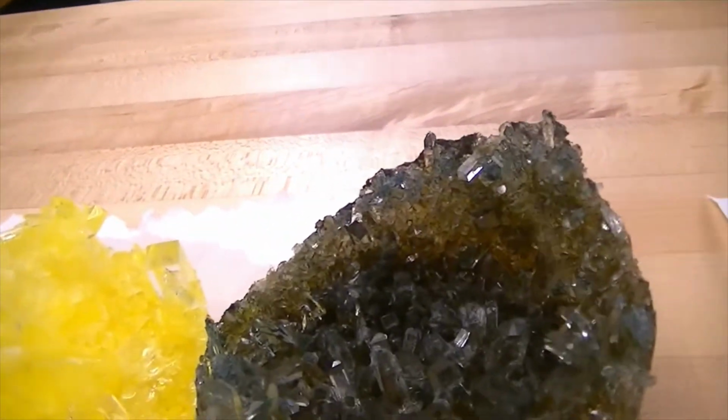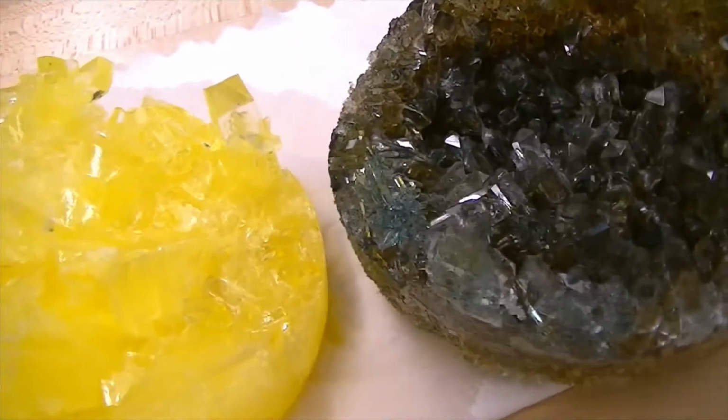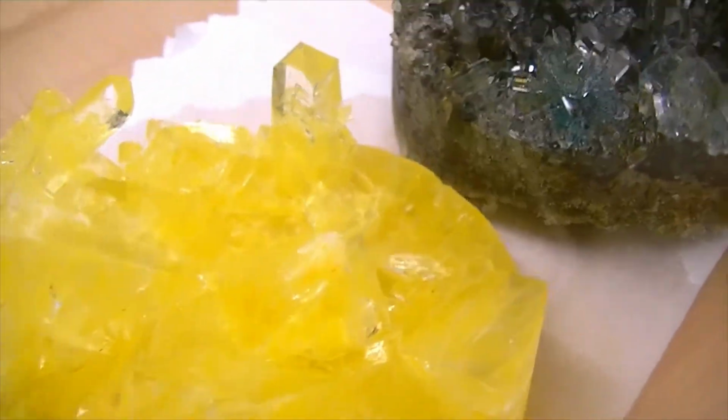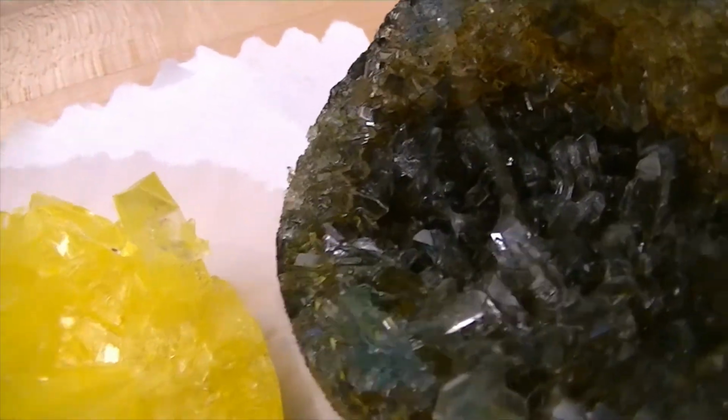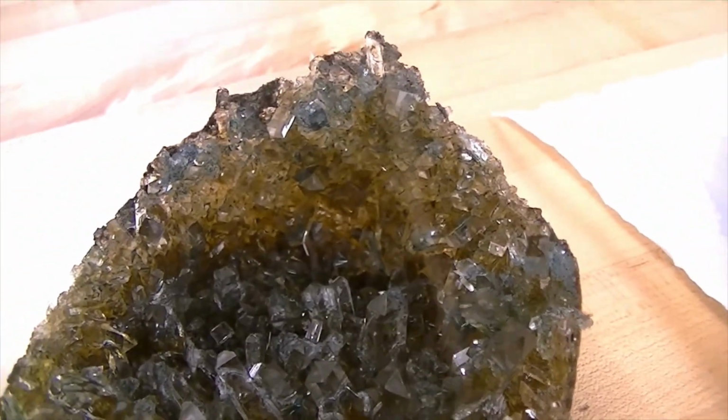I'm going to compare it to number 3 here. So number 3 had 350 milliliters, and look how large these crystals are. Whereas the 425 milliliter solution had small crystals.